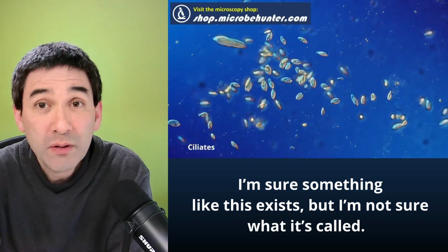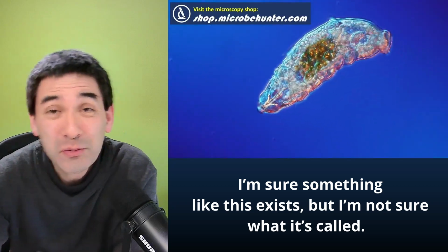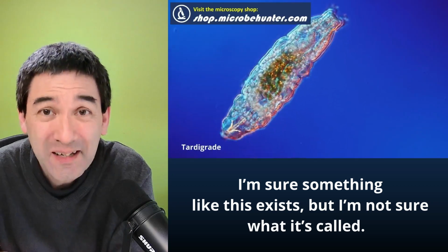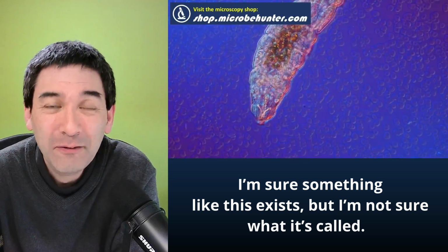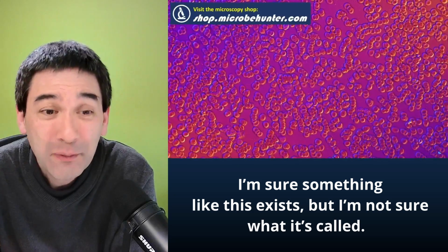Okay, I will assume that you're talking about light microscopes and not electron microscopes, because in electron microscopes you have to place the sample in a vacuum in any case. So it's not possible to use moist samples that contain water, because the water would immediately evaporate and fill the chamber, and it wouldn't be a vacuum anymore, but there would be water vapor in there.